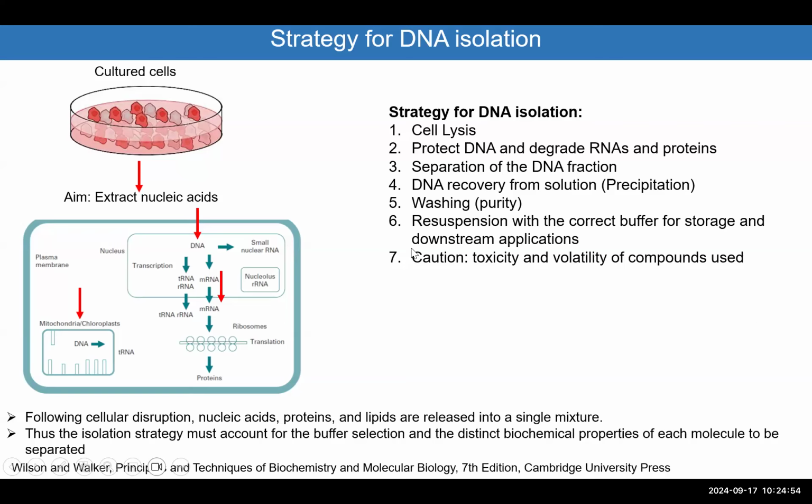And obviously, you have to take good caution about the toxicity and the volatility of the compounds being used, for your health and safety. Okay, so that's how I figure out a very simple strategy for how I will isolate the DNA.